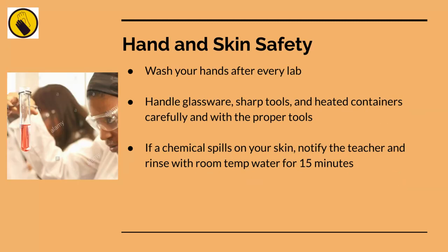Okay. Hand and skin safety. Wash your hands after every lab. This is going to be pretty easy, I would think, because we have to wash our hands every time we leave a classroom and come into a classroom for the most part. So this is just going to be a practice extended past normal everyday procedures. Handle glassware, sharp tools, and heated containers carefully with proper tools. There are some videos that you are going to watch or you already have watched, depending on when you're listening to this.